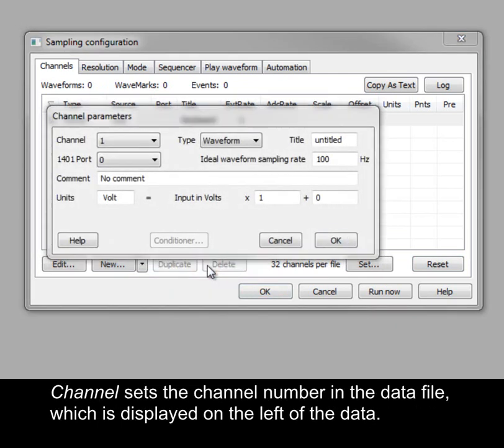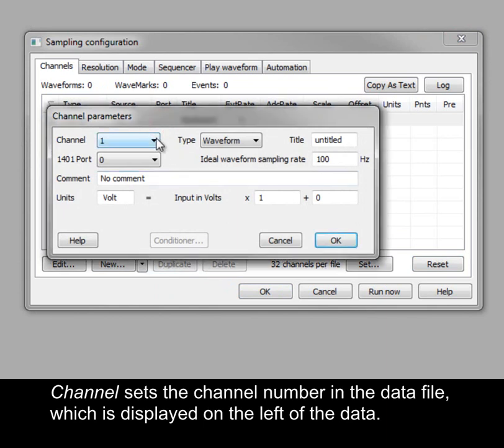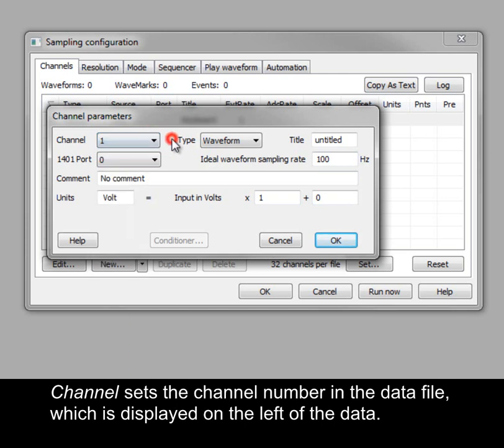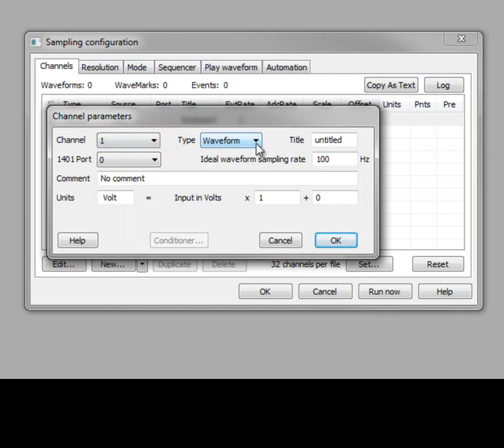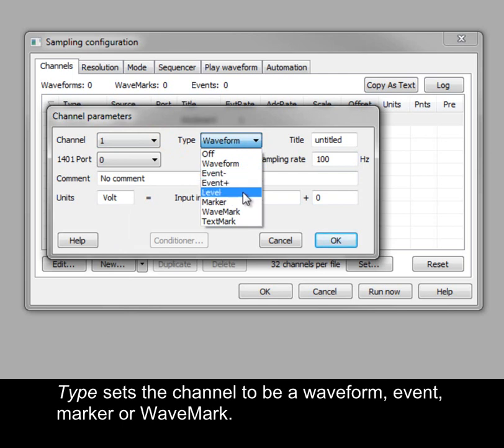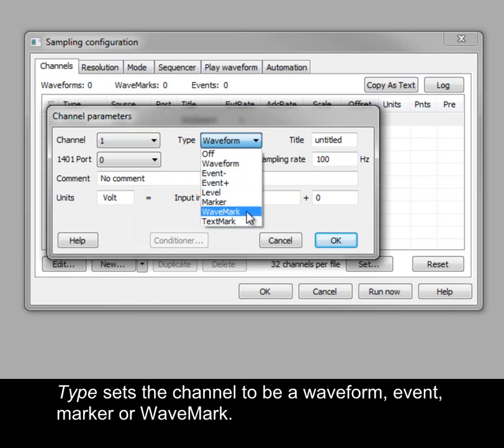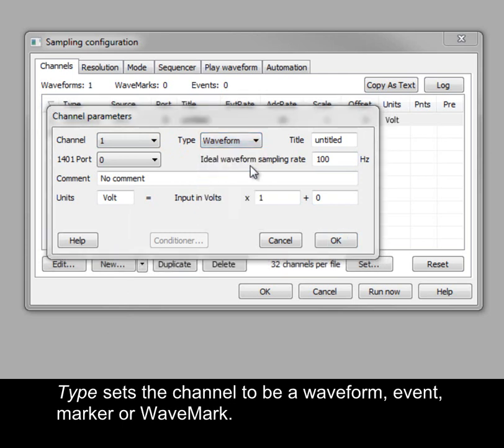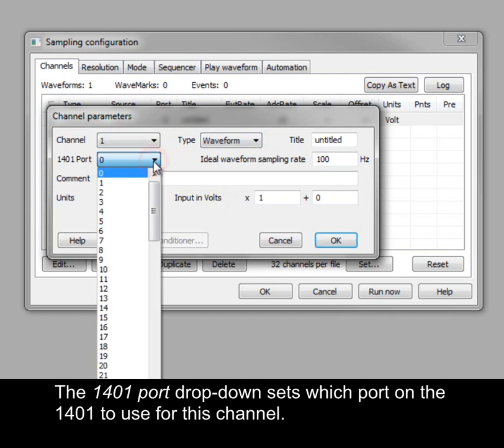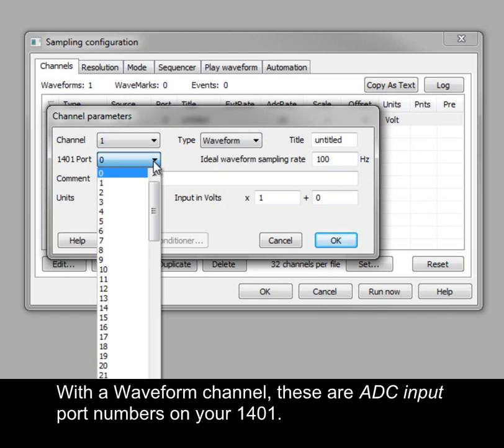Channel sets the channel number in the data file, which is displayed on the left of the data. Type sets the channel to be a waveform, event, marker or wavemark. The 1401 port drop-down sets which port on the 1401 to use for this channel. With a waveform channel, these are ADC input port numbers on your 1401.